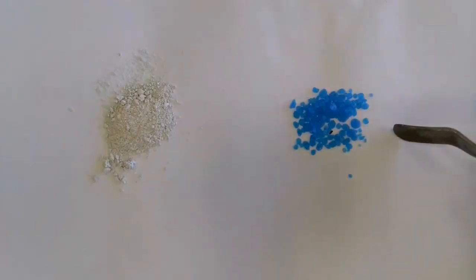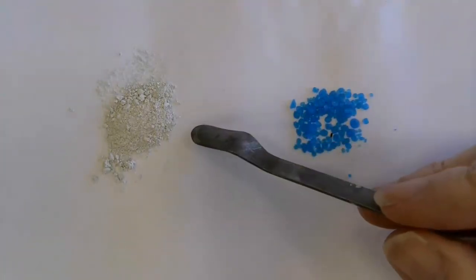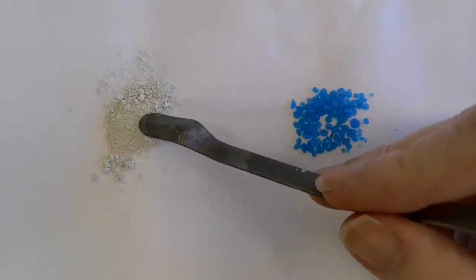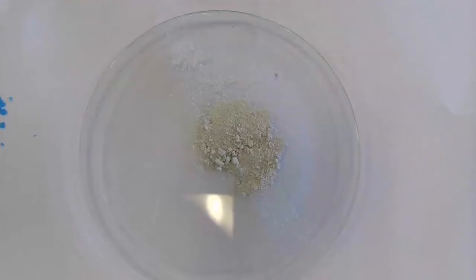Comparing the beginning and the end, we started with these nice blue regular copper sulfate crystals, and what we've ended up with is this white powder of anhydrous copper sulfate. You can see it's a very powdery version rather than the nice regular crystals we get with the hydrated copper sulfate.